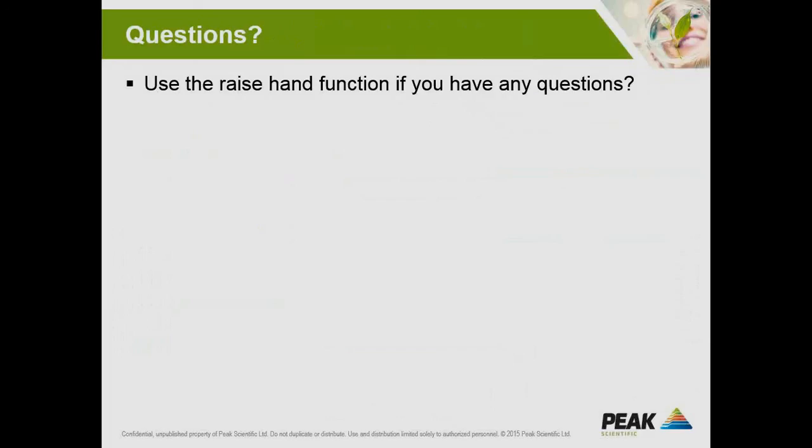It differs from customer to customer, but there is an indicator on the HMI screen on the generator which tells the customer when the silica gel needs changing. Again, this can be anything from every 2 months to every 2 years. It completely depends on usage. But the good thing about the silica gel is you can regenerate it twice, so you can use it 3 times, and then we would recommend changing the silica gel.